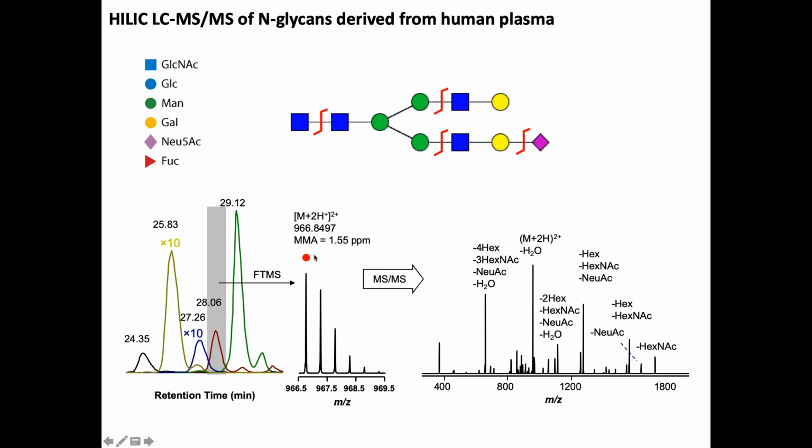You guys in the mass spec course, we kind of hit you over the head with the monoisotopic mass. How do you calculate it? This is the most isotopically pure peak that you use for identification, or at least for the initial identification. This glycan has a 2+ charge state.